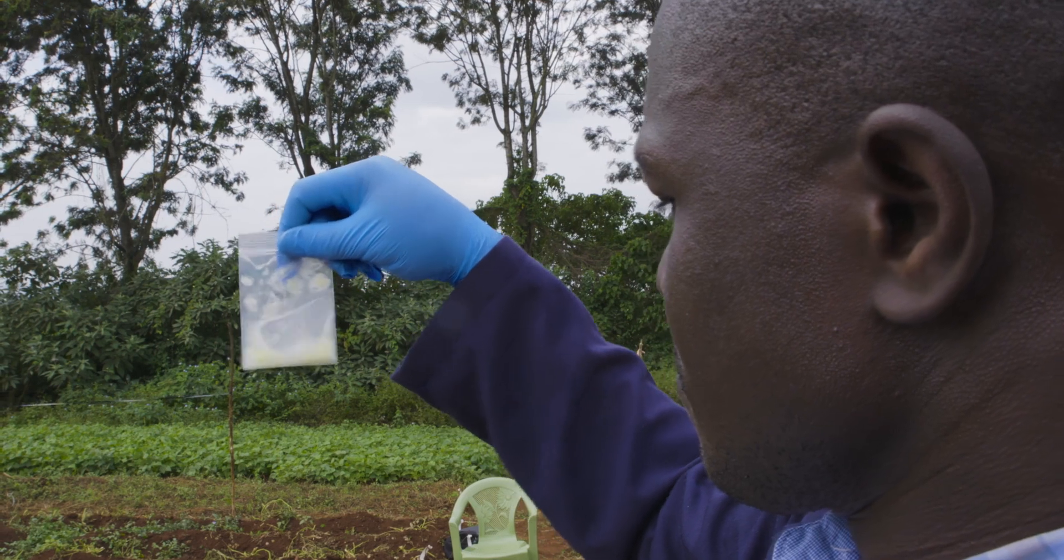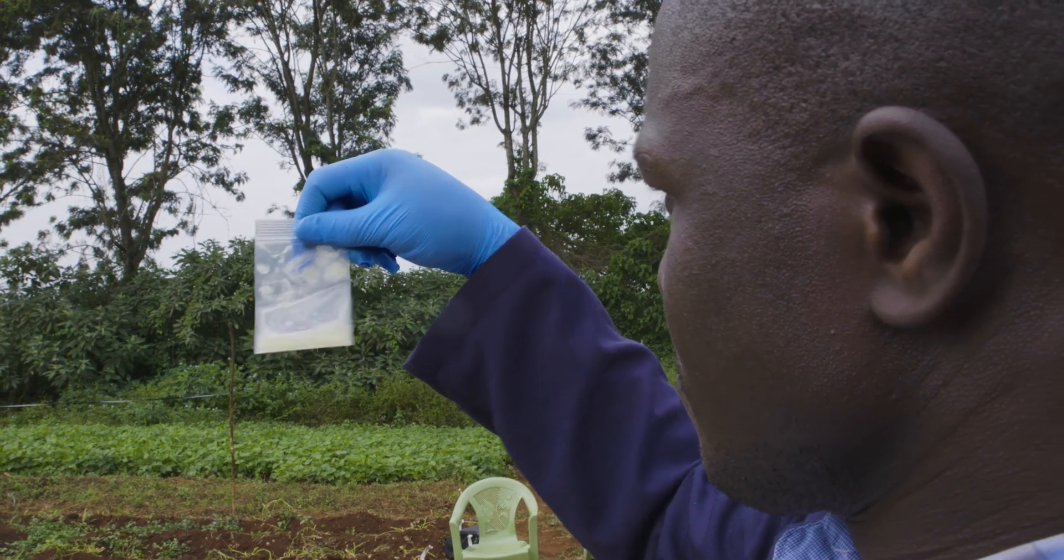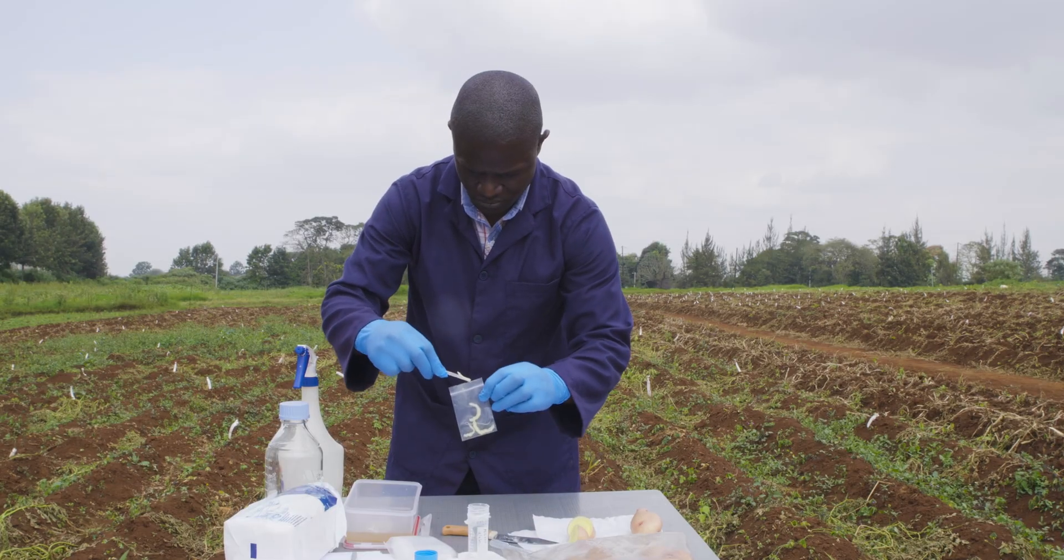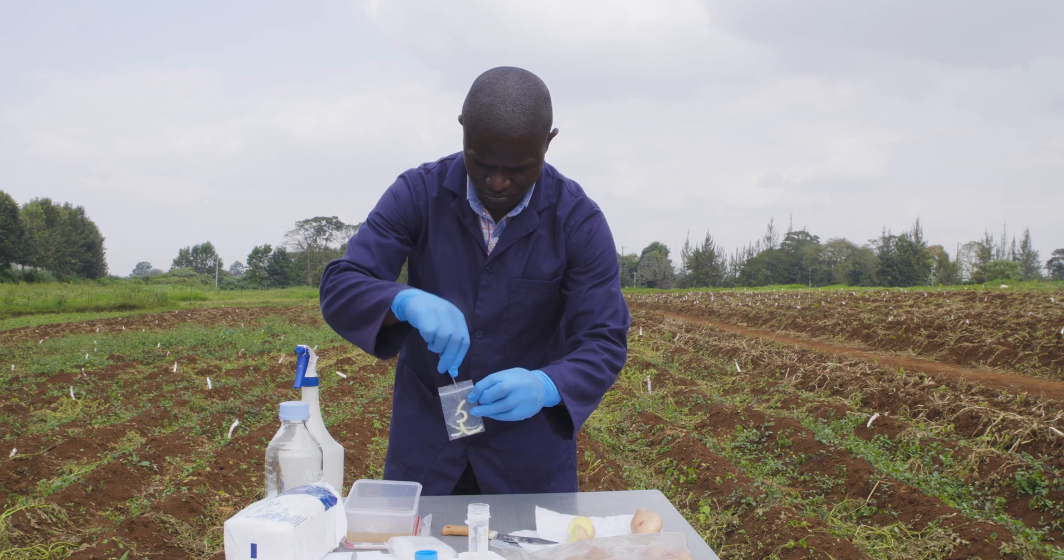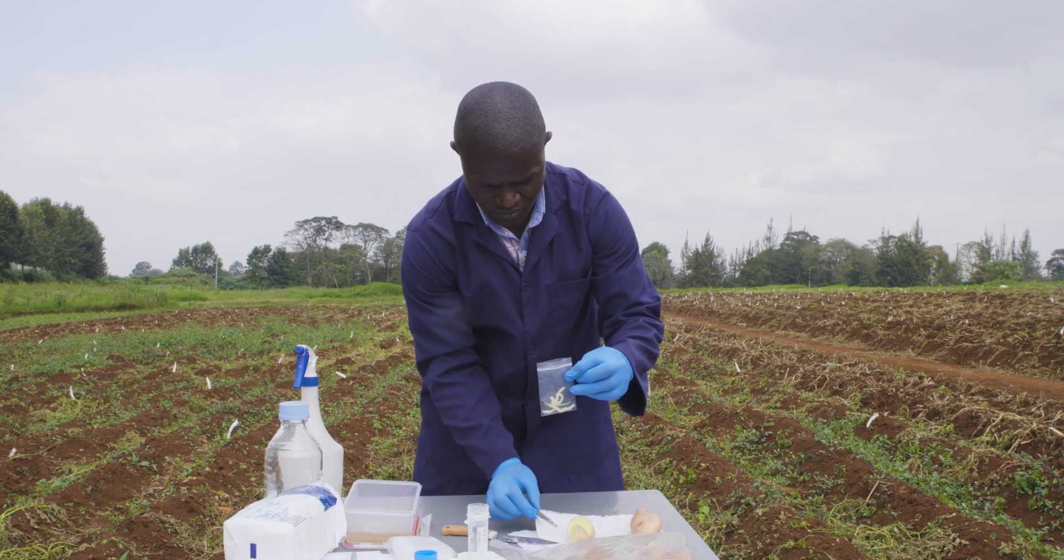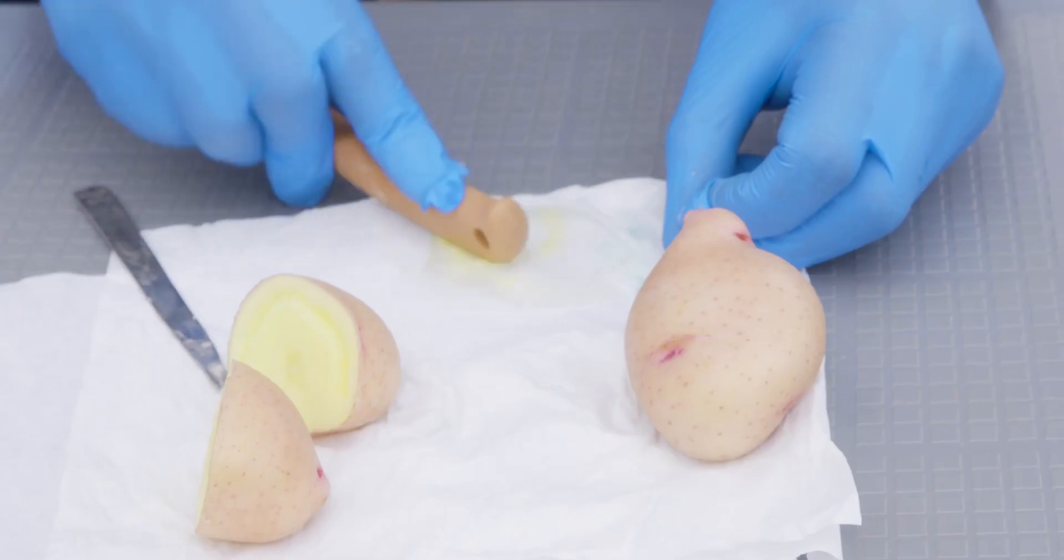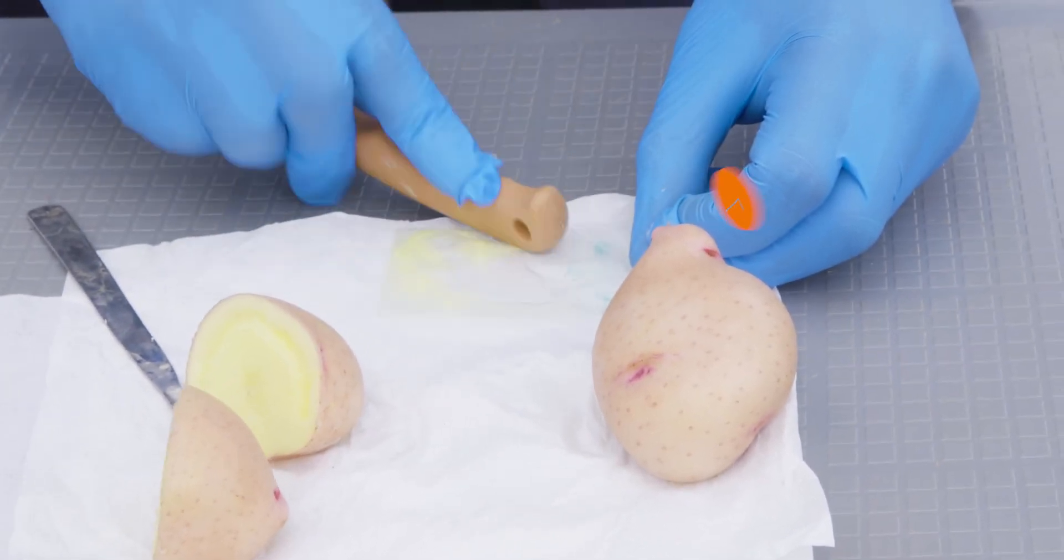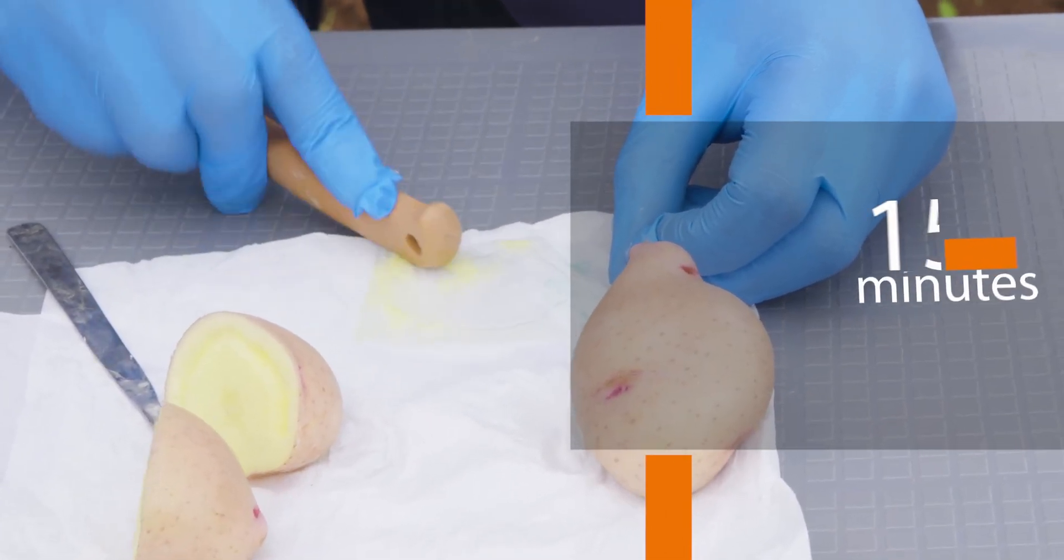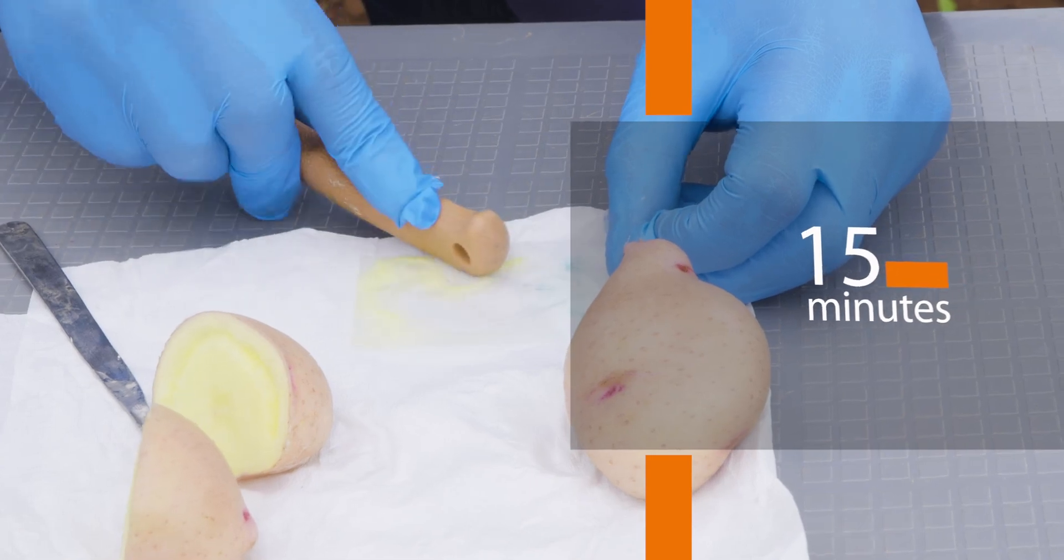If you are conducting a seed load test for latent infection, you can use a coring device attached to falcon tubes with an extraction buffer to collect composite tuber samples. Manually crush the sample and let it stand for 15 minutes before using it as a template for lamp reaction.